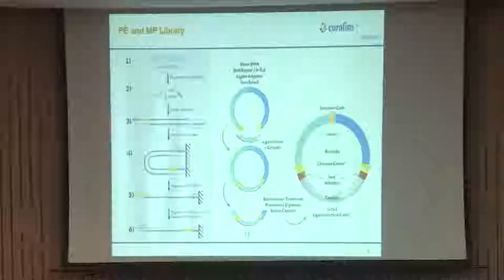So we know after sequencing, we get a whole FASTQ file. From there, we segregate sample wise based on these small 8 base indices. These are called Illumina indices. After that, we have the sequencing adapter, and then I have the DNA template.